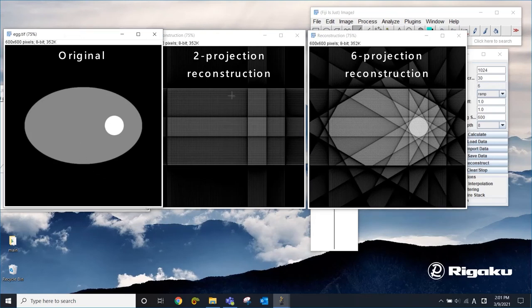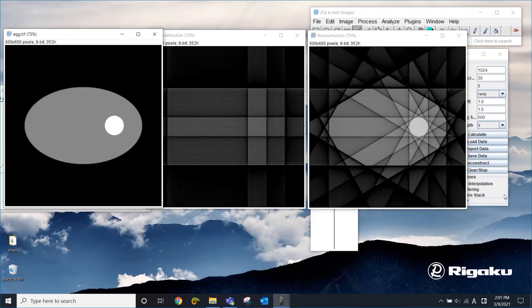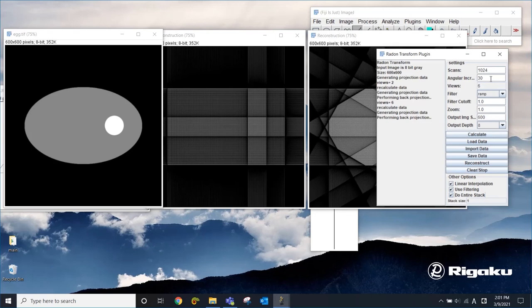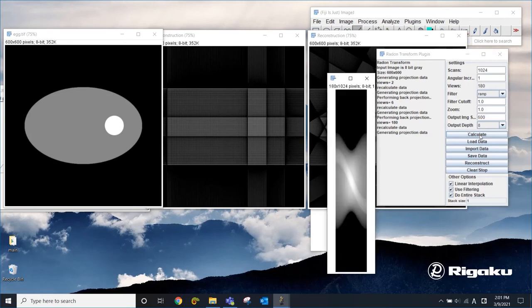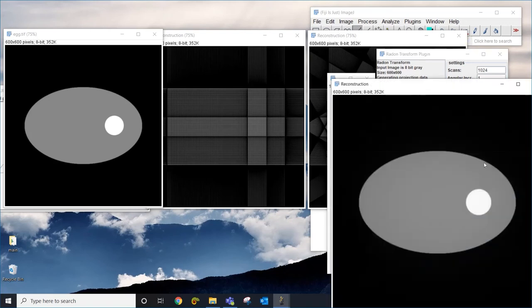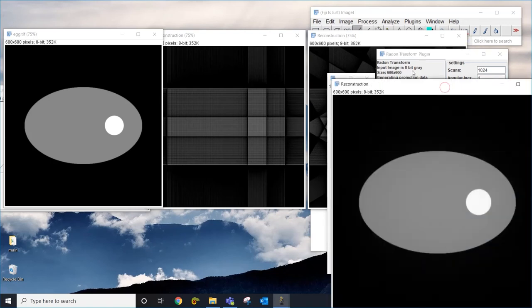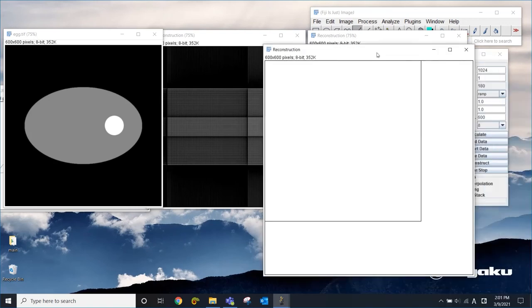Now I'm going to jump all the way to the original setting, one degree. Now we're going to create 180 projections like this. And if you use all of them to reconstruct the original image, now we get this.